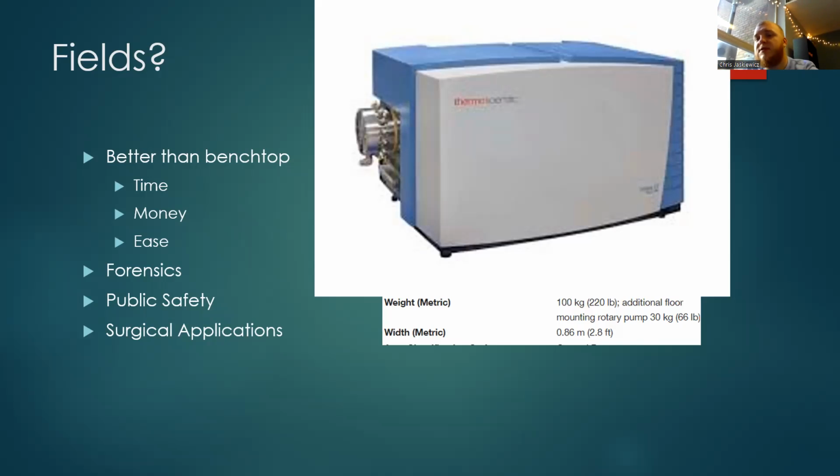If we're able to use this miniaturization technology, think about real-time analysis of air quality, finding if any airborne chemical warfare weapons, biological nerve agents, explosive residues that are in the air are able to be pumped into this miniaturized mass spectrometer and immediately be notified to the public to increase their safety.